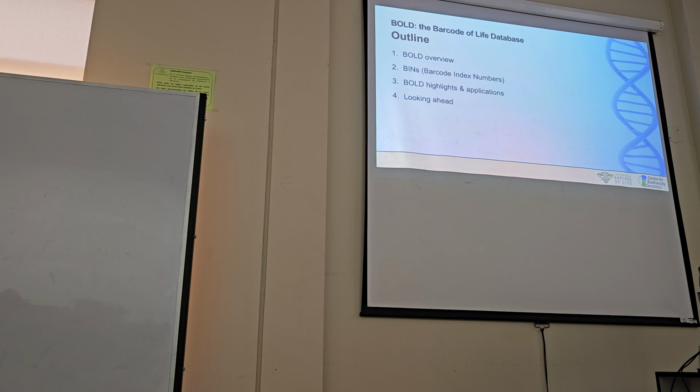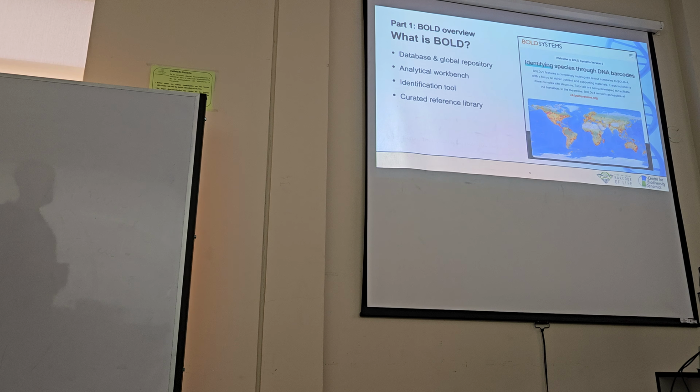So we'll tell you about what BOLD is, an overview, what BINs, or barcode index numbers, are, the best features of BOLD, how we use it, and future plans. Okay, who here has used BOLD? Who's been on the website? Anybody? One? No? Okay.